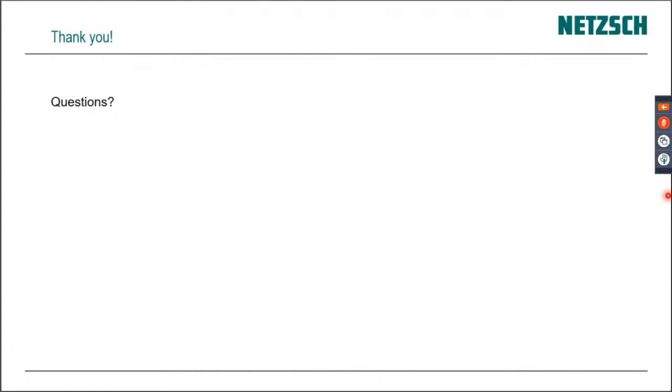Thanks. I have a question here. In the case of a gel, which parameters should I take into account for evaluating if the gel behaves as a chemical gel or as a physical gel? That's a good question. So a chemical gel usually would be a liquid that after a set time has cured or undergone some reaction to form a gel. I guess that's what is meant by that.